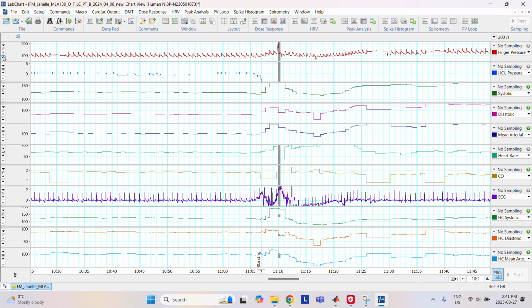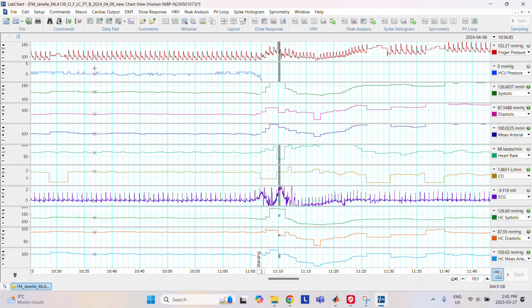I'm trying to make it a little larger. Yeah. So sometimes you get that noise where it's detecting a noise like that. Can you see? That's not good. And so what you want to do at this point, and it wouldn't affect the other points, right? Because 5% is the least amount of threshold that you need. You want to increase it a little bit. So right now we're going to try increasing it to 7.